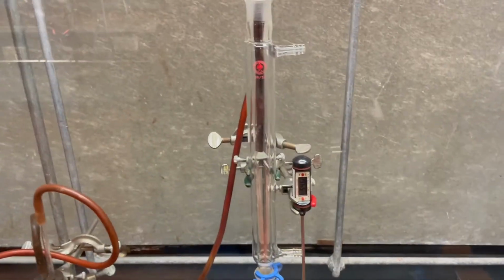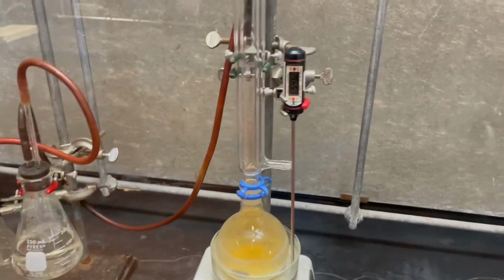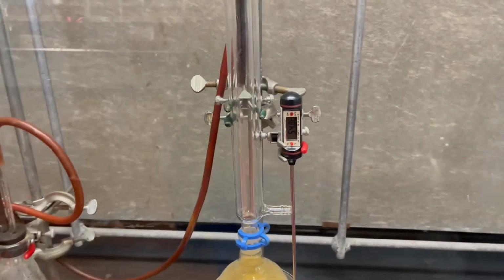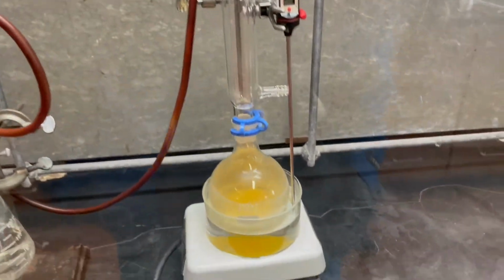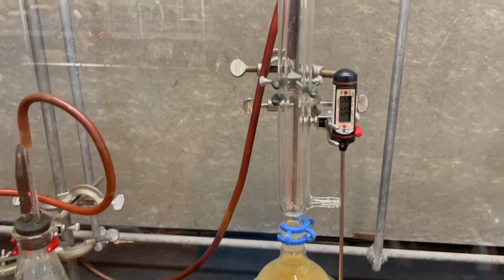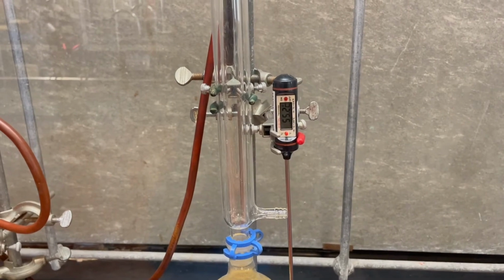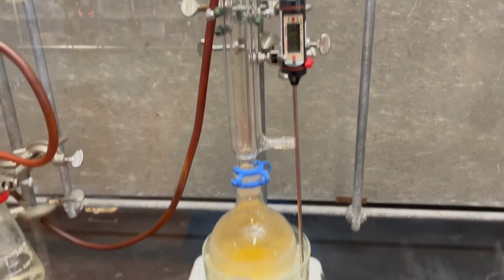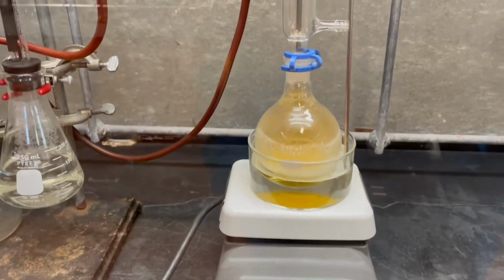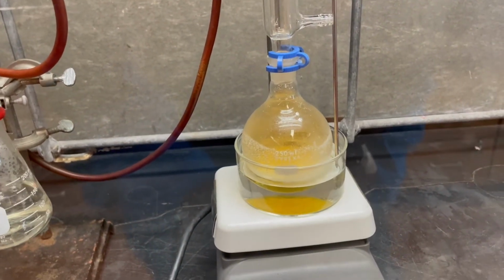It's at like 65 right now. We're almost there, y'all. So what I ended up doing was putting a little clamp right there so this thermometer can stay right there, and the water isn't touching the bottom of the flask so that it gets a real temperature of that water. As you can see right now, it's about 55, which is not 70, is it? Anyway, I think you can start to see some gas evolve though, right?